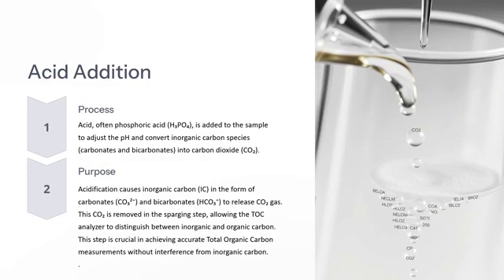The purpose of this step is that it isolates non purgeable organic carbon, NPOC, by ensuring that inorganic carbon does not interfere with the TOC measurements. Without acidification, the analyzer might measure inorganic carbon along with organic carbon, leading to inaccuracies.